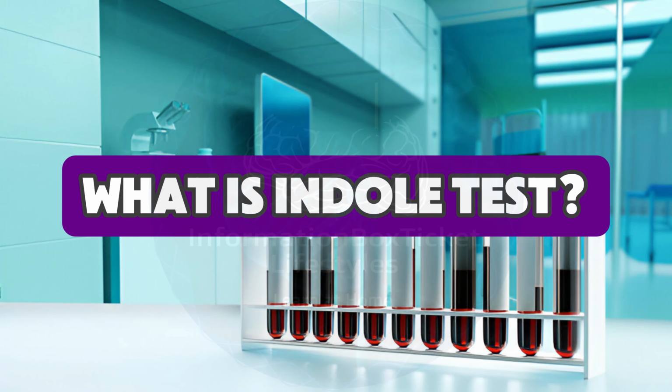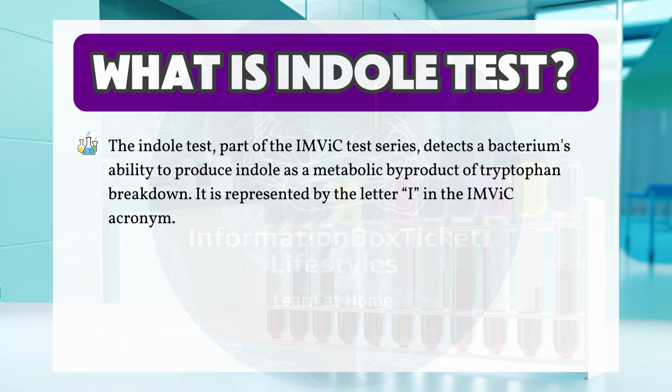What is Indole Test? The Indole Test, part of the IMViC test series, detects a bacterium's ability to produce indole as a metabolic byproduct of tryptophan breakdown.